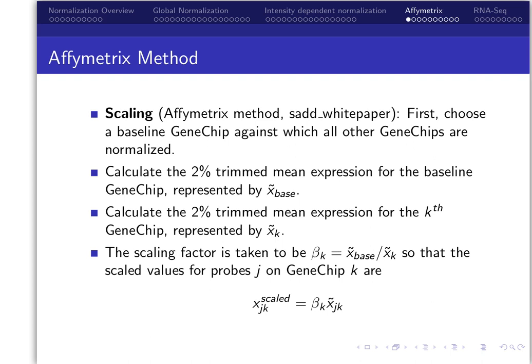The company Affymetrix has a specific normalization procedure in their software. After hybridization, Affymetrix gene chips are scanned and the resulting pixel level intensities are stored in a DAT file. Then the Affymetrix gene chip operating software calculates probe level expression as the 75th percentile of the interior pixels for each probe, and these results are provided in CEL files. Therefore, a CEL file stores one value for each perfect match and mismatch on the entire gene chip.